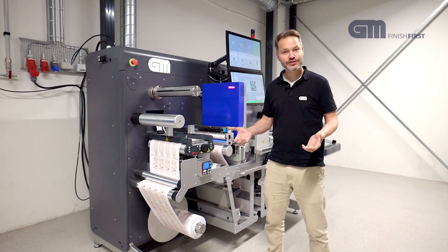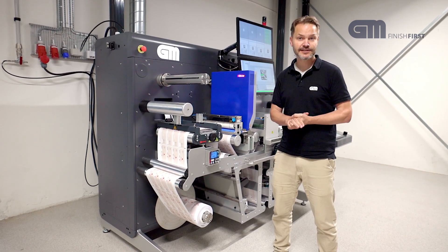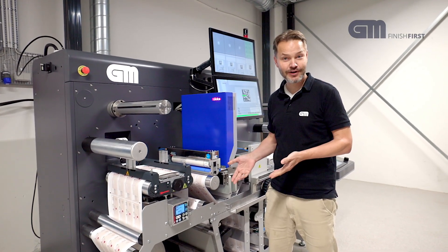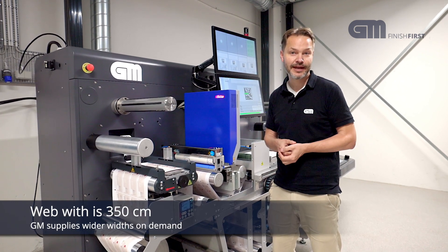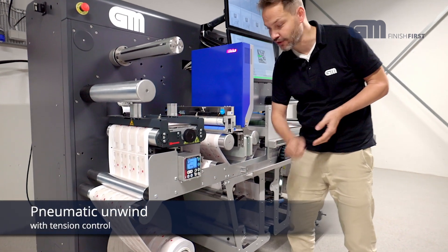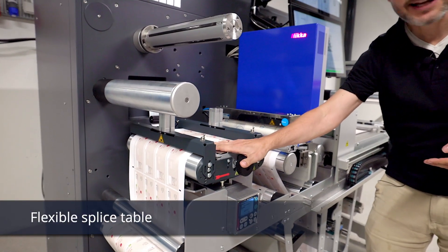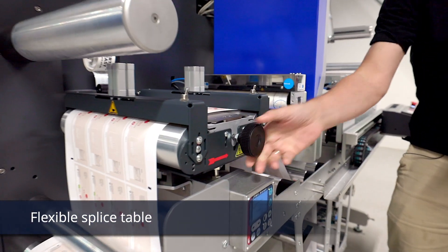I'll now take you through the different stations on the machine and explain the features step-by-step on the IR 350. The machine runs left to right. The web width is 350mm — we can supply wider on demand. We start with the unwind: there is a pneumatic unwind with tension control. The web then travels up to a splice table, the nice type where you can actually splice right in between the labels, on your waste.